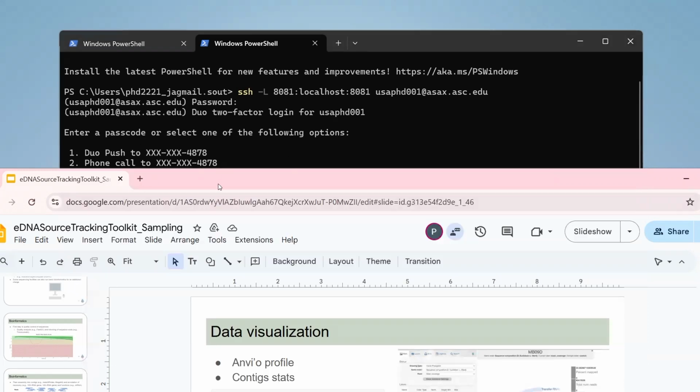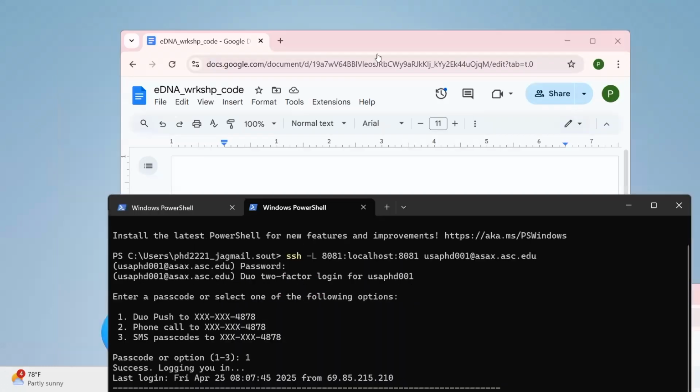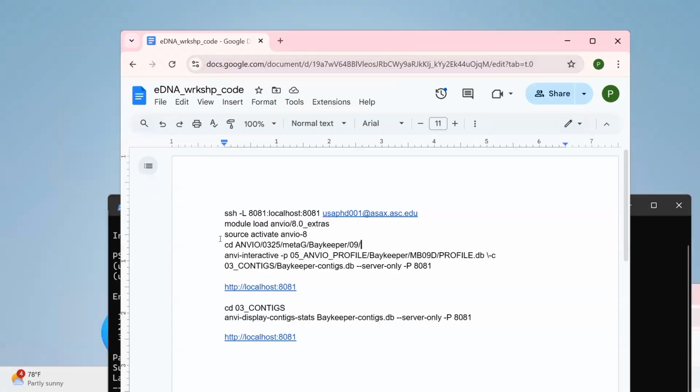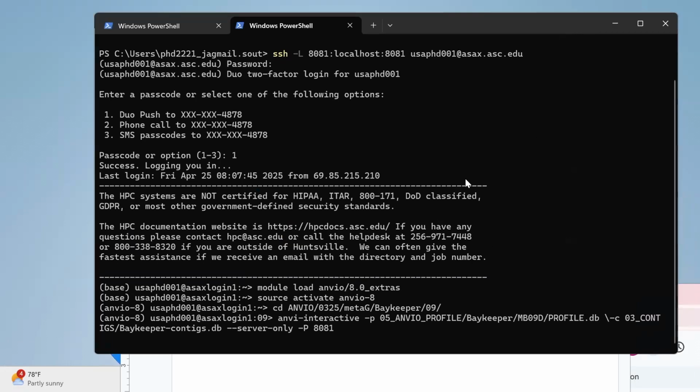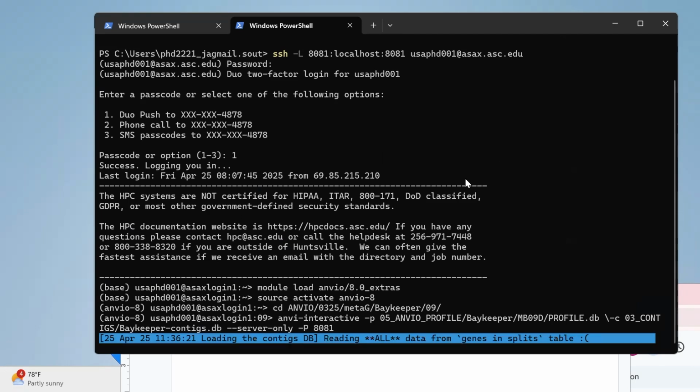Okay, so I'm going to copy and paste this into here. And it's going to take a little second. It's slow, but it's going to run this and it's going to give us an output that I can paste into a web browser to generate that visualization.